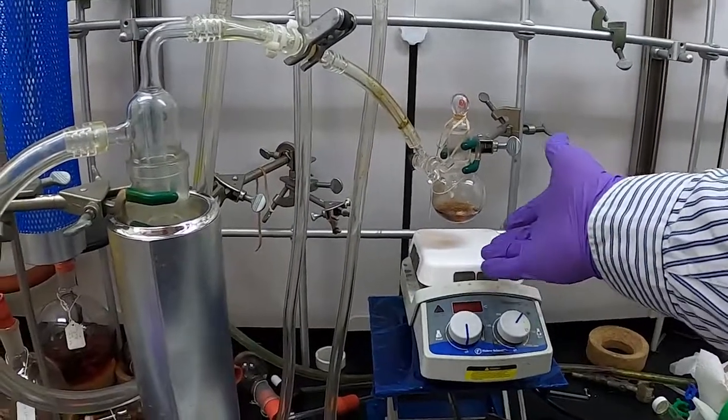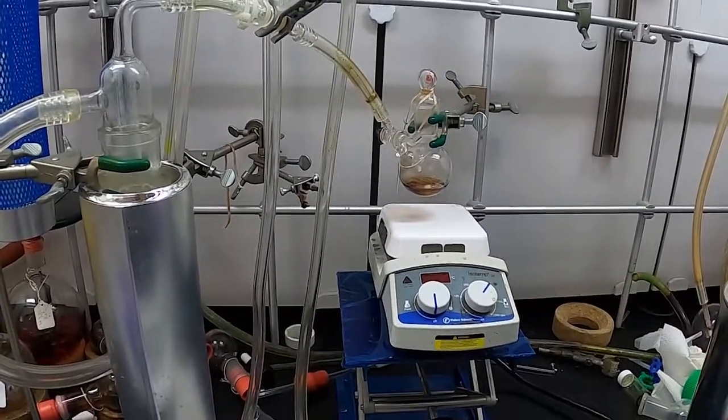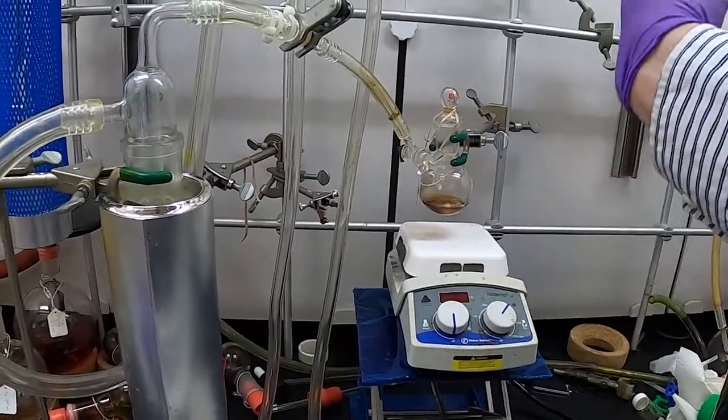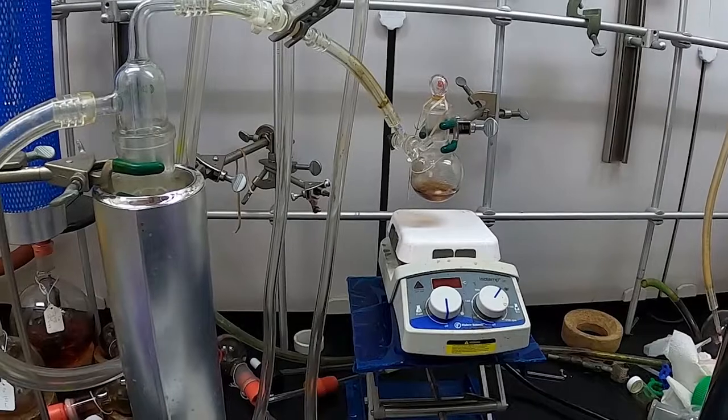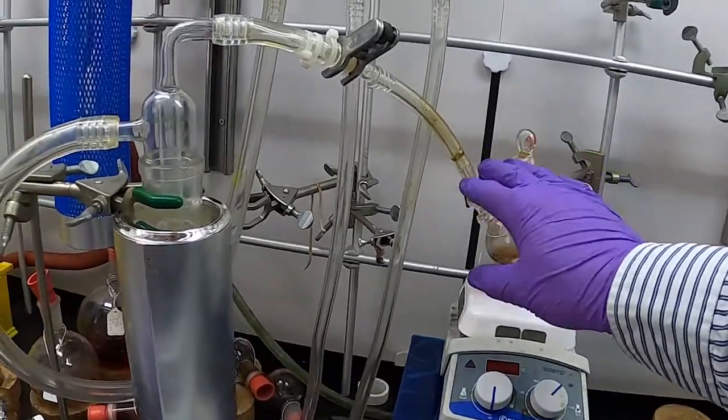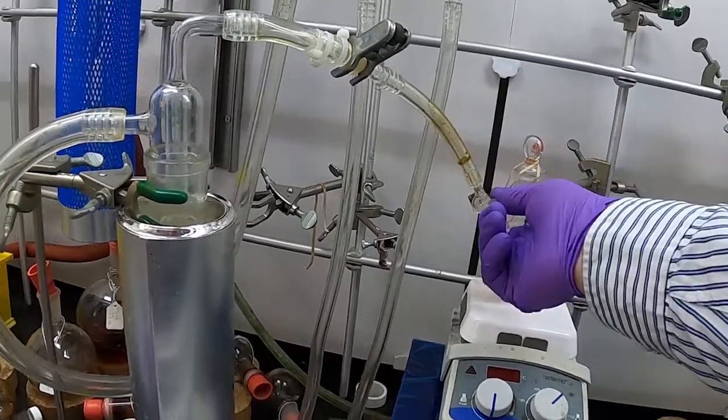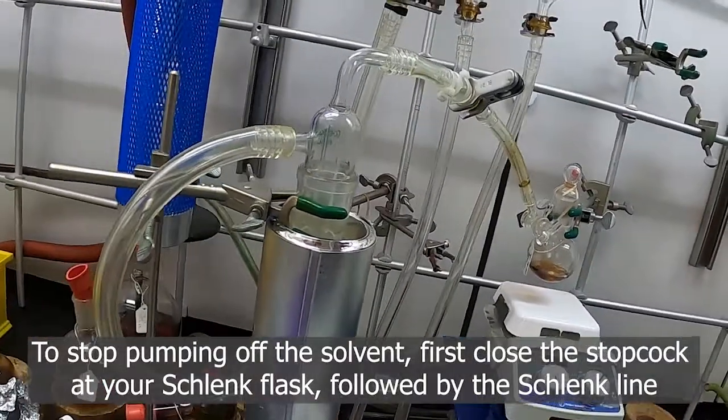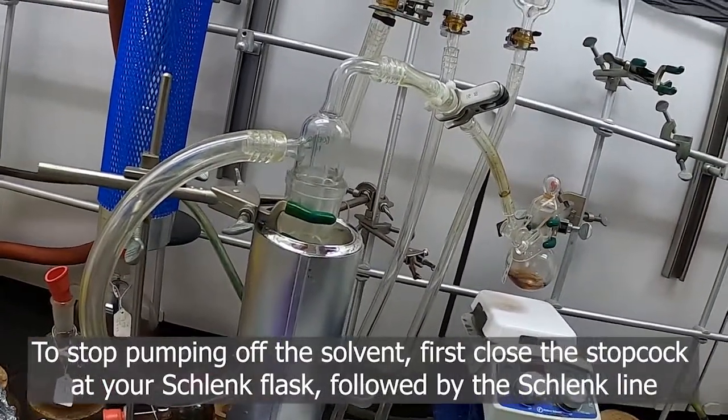We've now finished pumping this respective compound down. This one is mostly a liquid, so it didn't pump all the way down—we just pumped a small amount of solvent off. I've already closed this off here, so we were pumping all the way there. We can close it off now. To close off the vacuum, we work backwards. We close this off here.